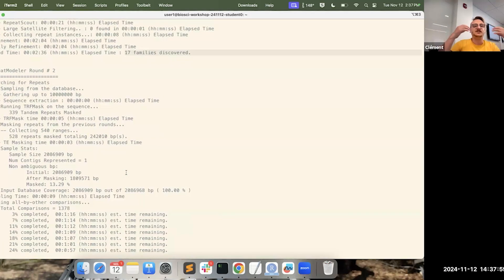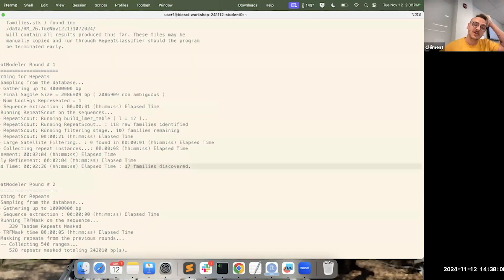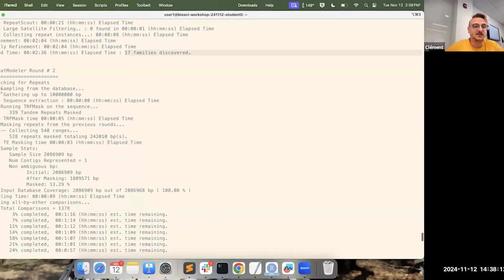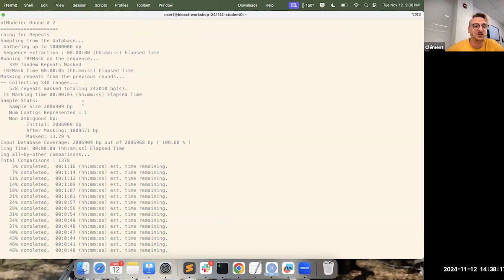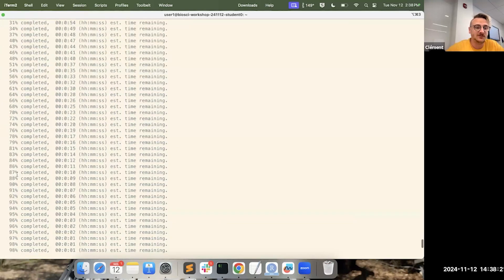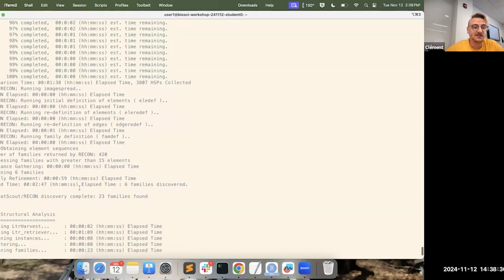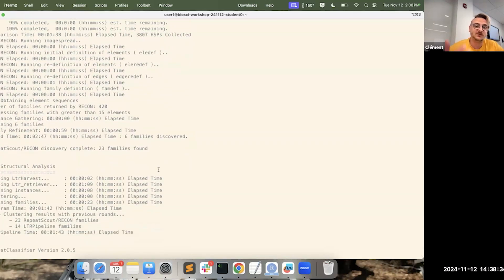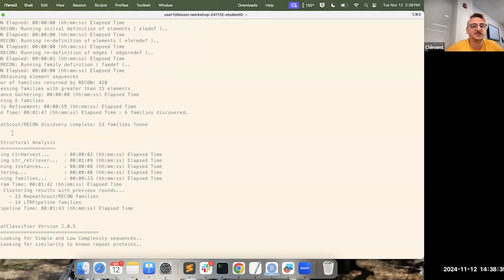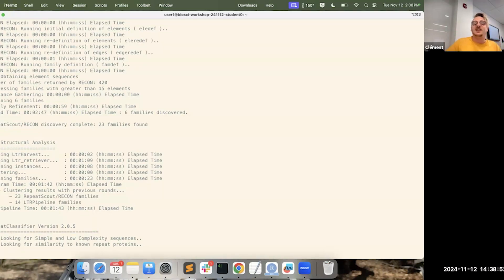Looking at our terminal, Round 1 ran RepeatScout quickly and found 17 families. Round 2 takes a new sample, masks those 17 families, and uses RECON — much slower, much more sensitive — to find more diverged families. This step takes a while to reach 100%; it's the bulk of the analysis. It found 23 additional families. There is no Round 3, 4, or 5 here because the algorithm determined it would not find many more families by resampling — which makes sense given our small input.